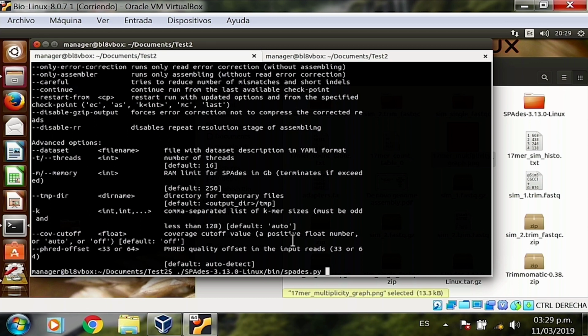But this can also be estimated by the program. We could also estimate that from the k-mer graph we did before. We saw around what sizes we expected the multiplicity to be for real k-mers of the genome. And we saw that there was a repeat, like a smaller hump farther down the road, around 120 coverage. So that's what we would expect to be correct.